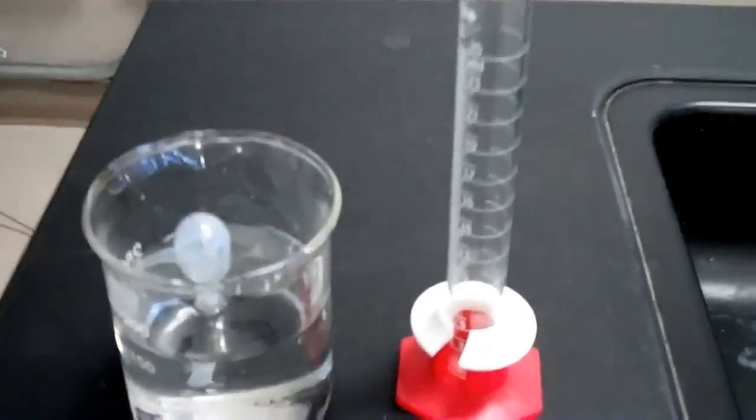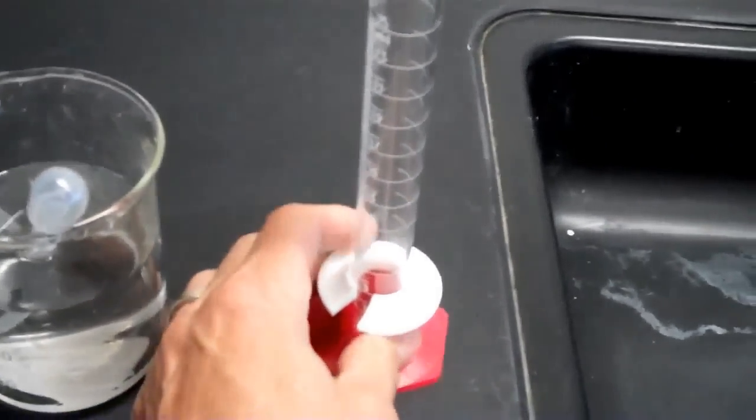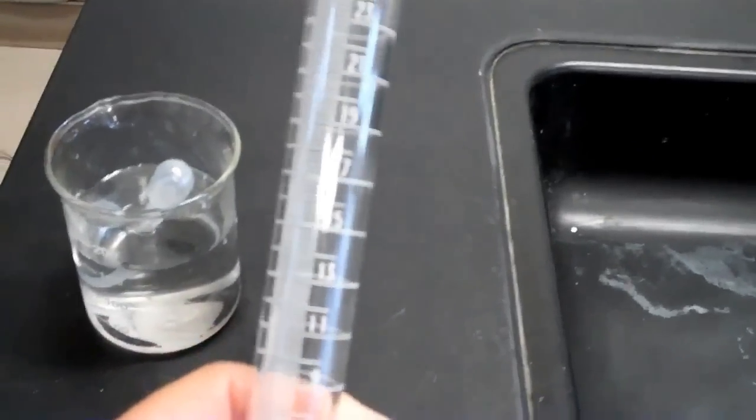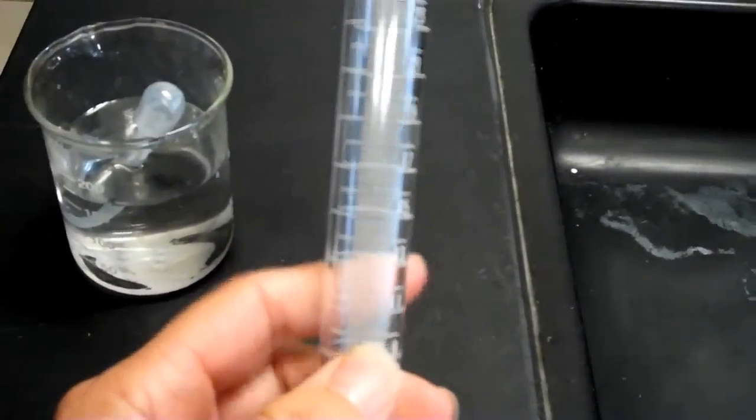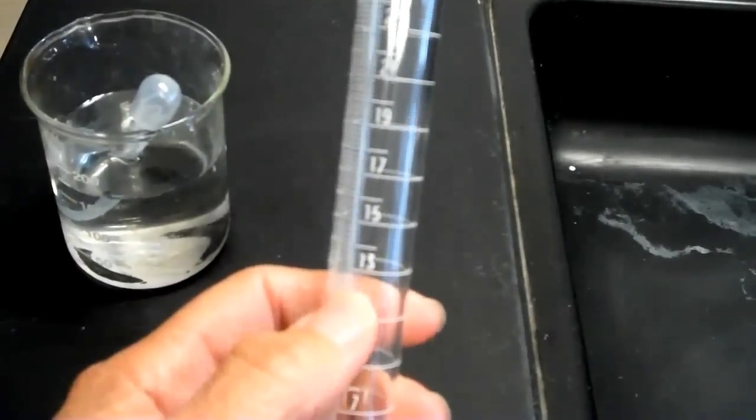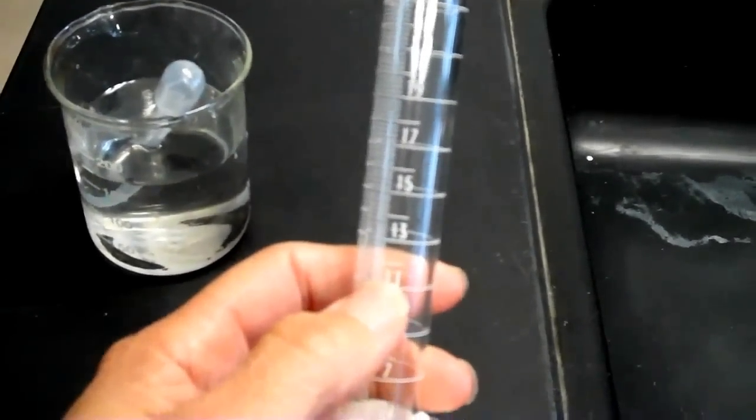So I'm going to start with a graduated cylinder here. And first thing you need to do is look at the marks on the graduated cylinder and make sure that you know what the smaller marks represent.